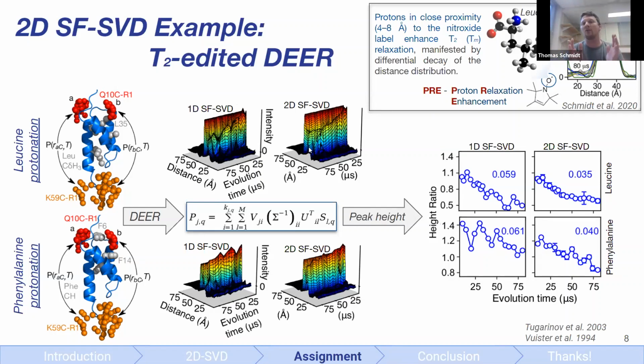And we now analyze the time traces once with the 1D SF-SVD method and once with the 2D SF-SVD method. In such a manner, you will see right away that the decreasing one has its tails, has valleys, so it's very ragged. However, upon applying the 2D SF-SVD, it smoothens out. So if I were a skier and I were in the Alps or the Rockies, I'd probably pick the nicer slope.